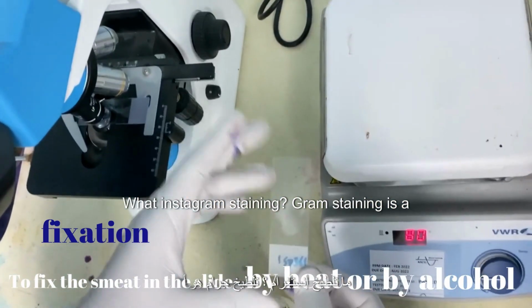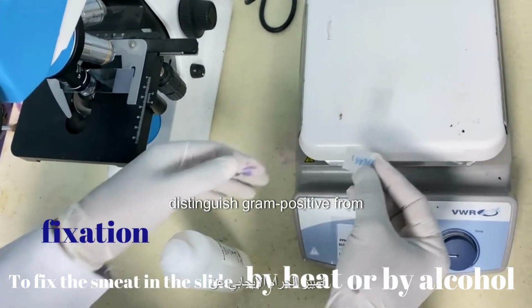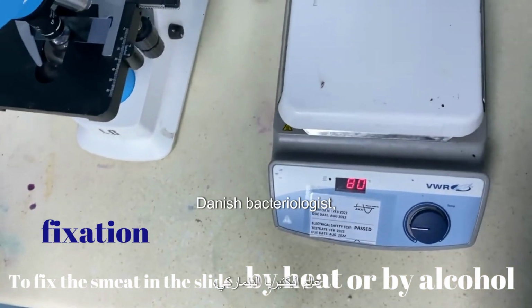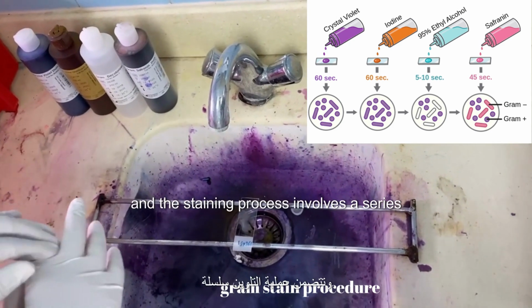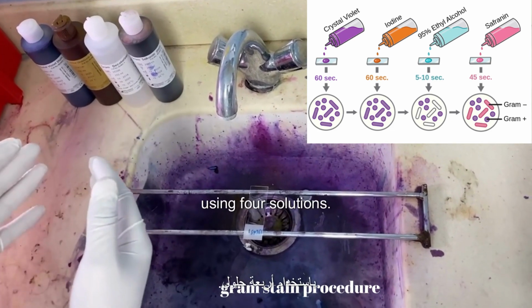What is gram staining? Gram staining is a differential staining technique used to distinguish gram-positive from gram-negative bacteria. It was introduced by the Danish bacteriologist Christian Gram, and the staining process involves a series of steps using 4 solutions.